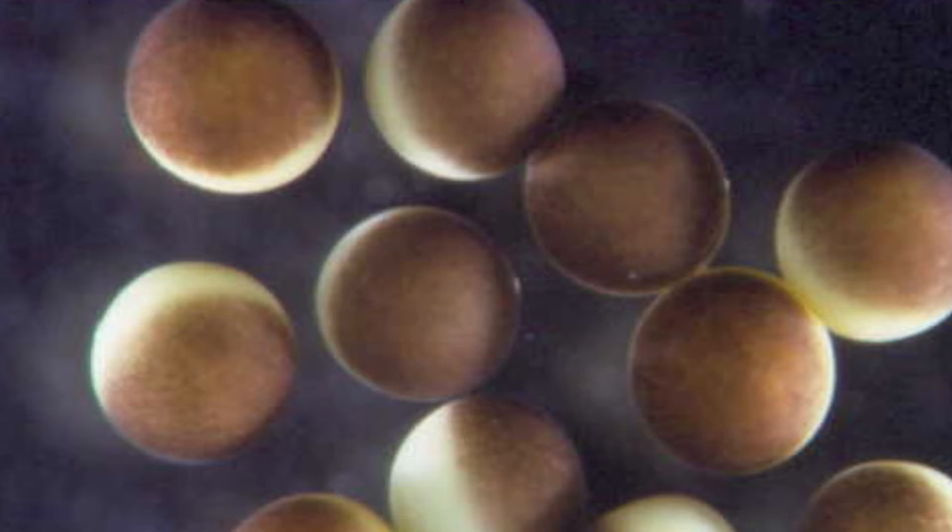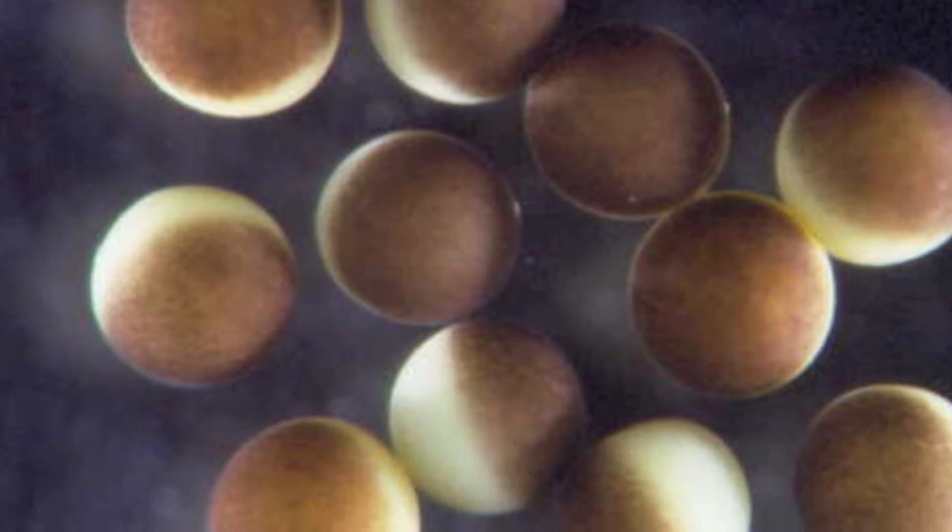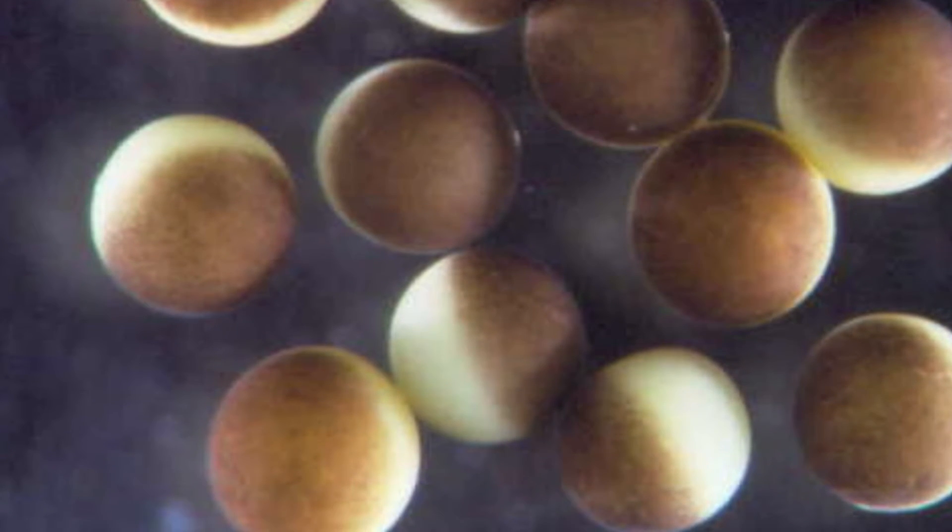The volume of a normal Xenopus oocyte is about 500 nanoliters. The instrument can inject from less than 1% to over 10% of the total volume of the oocyte in one preset step increment.